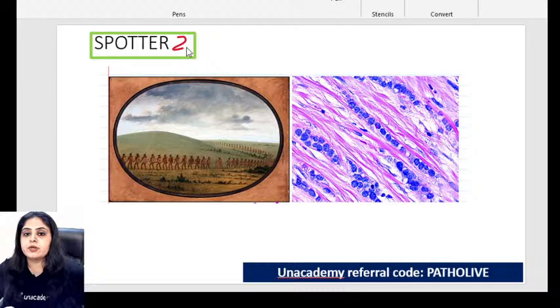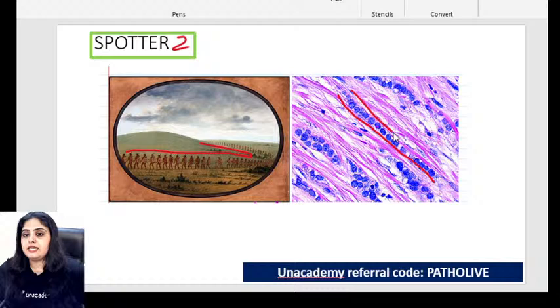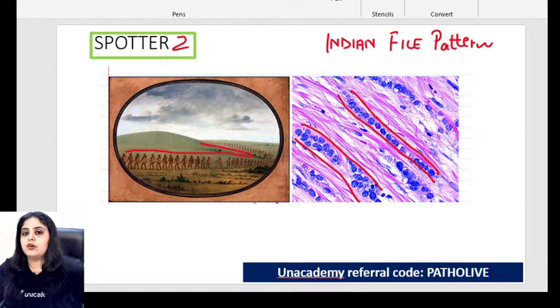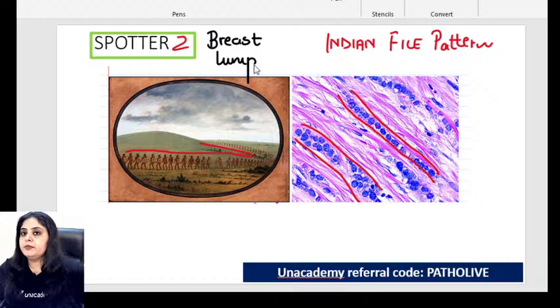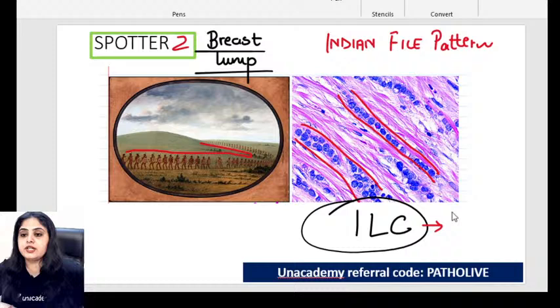Moving to spotter number two — the all-time favorite, an evergreen NEET PG and FMGE question. I don't think I need to give a history, though in the exam you will get one. Everyone's put the answer right away. Think of men standing in a line one behind the other — the tumor cells are arranged the same way. This pattern is known as the Indian file pattern. In the exam, you'll get a history of a breast mass in a 52-year-old female, and with Indian file pattern the diagnosis is invasive lobular carcinoma.